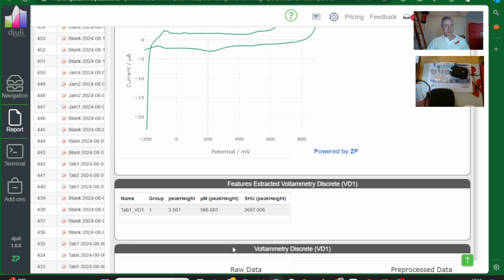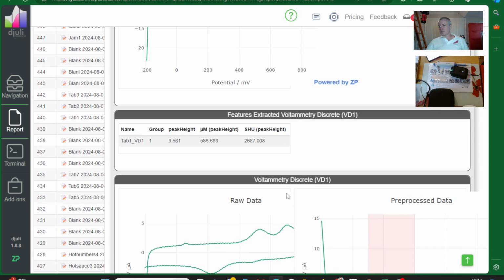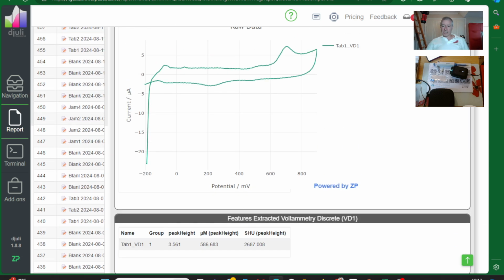And then we've also rounded the Scoville Heat Units as well. So the Scoville Heat Units on my phone says 2,690. You've got to understand that in the cloud we say 2,687.008. It's just the app rounds it because we want people to have a nice user experience. And whether you report a Scoville Heat Unit as 2,690 or 2,687, it really doesn't matter. It's probably not even a 0.001% difference.